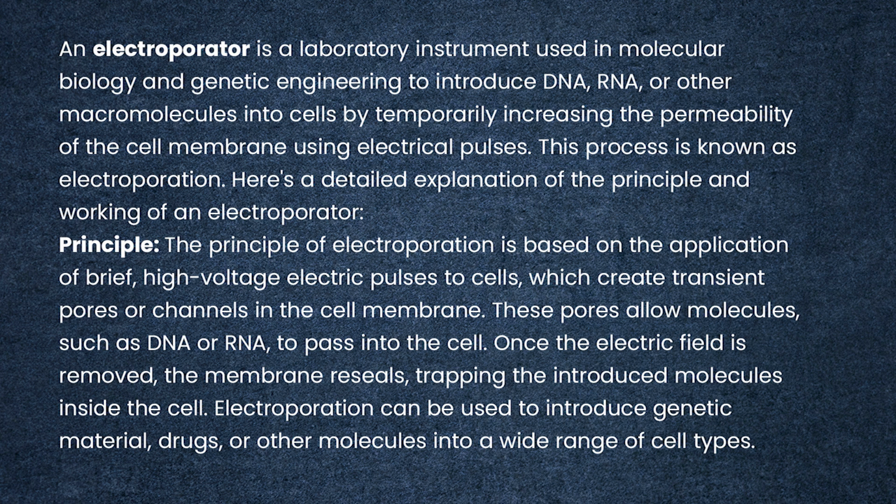Here is the detailed explanation of the principle and working of the electroporator. Basically, the electroporator is based on the principle of application of brief high voltage electric pulses to cells, which create transient pores or channels in the cell membrane.